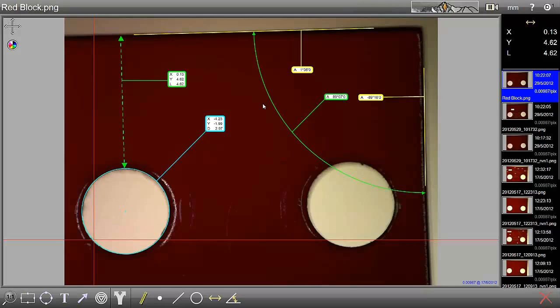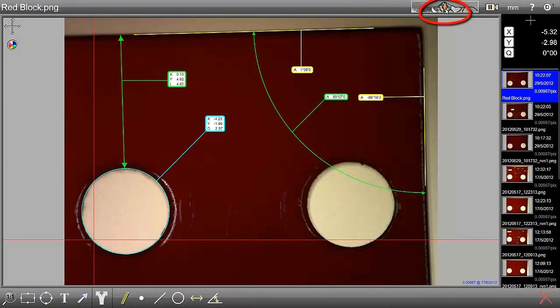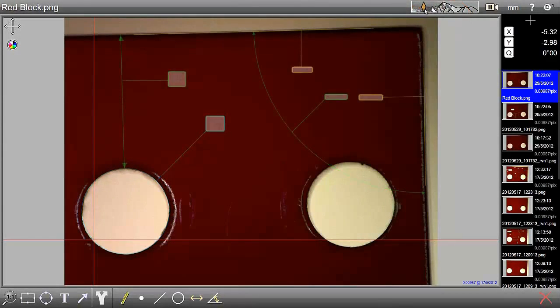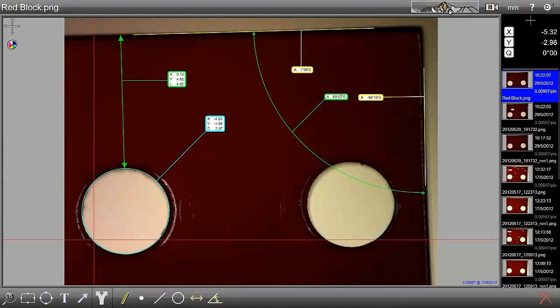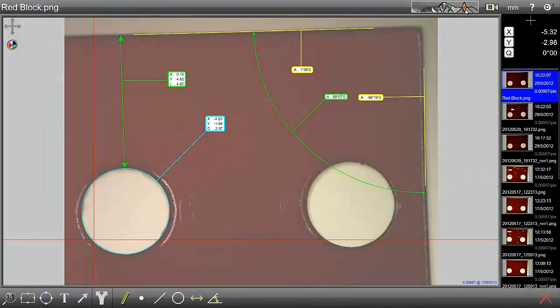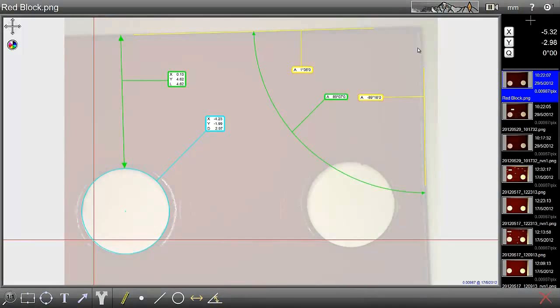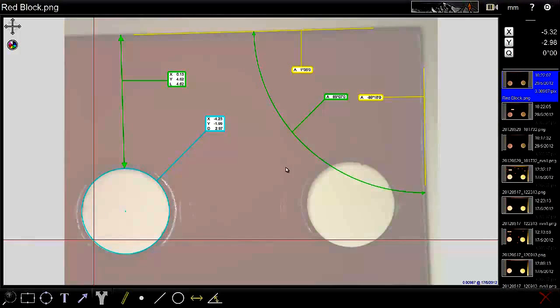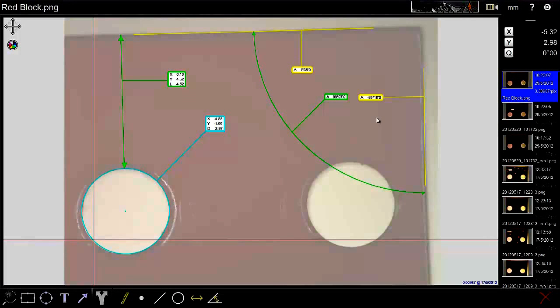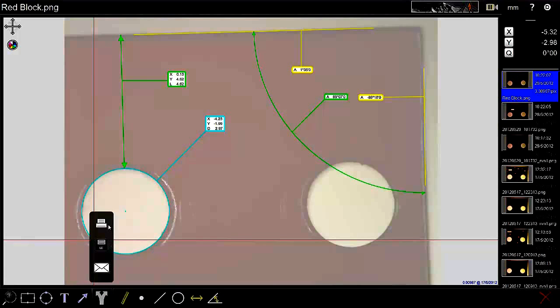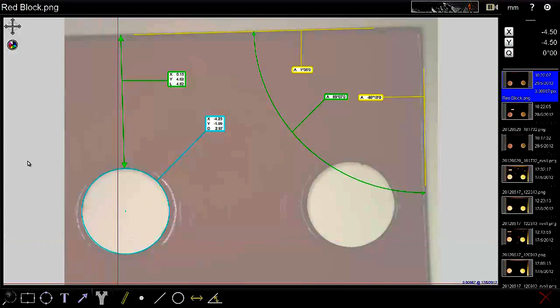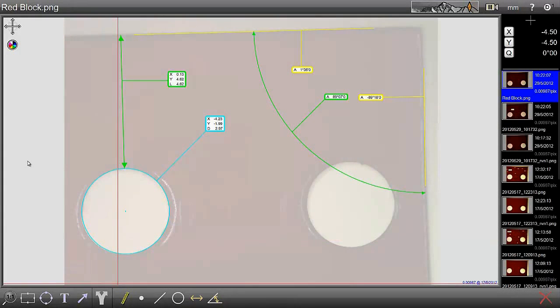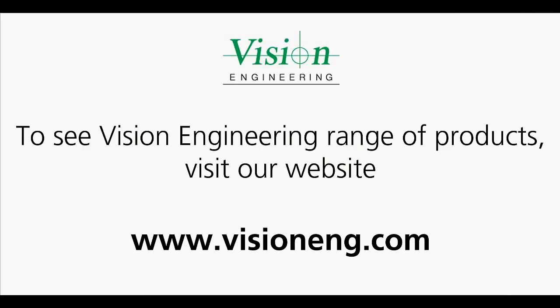How do I display all this information clearly? Well, we have this key called the opacity key. This allows us to actually fade from either the part only or fully over to the dimensional information only. In this nice easy slider. We just select the point where you would like to see the right mix between the part and the data. At this point, I can then save it, email or print as before. And you can take multiple positions and multiple snapshots and save them in different opacity figures to give you the best picture. This is a basic function of Vision Engineering's new dimension software package.